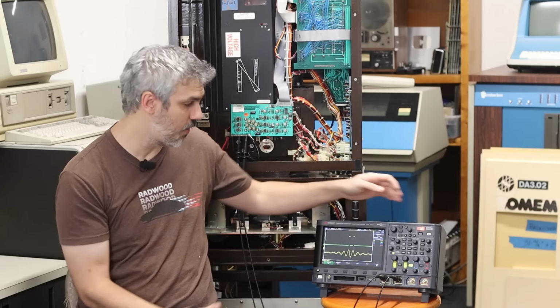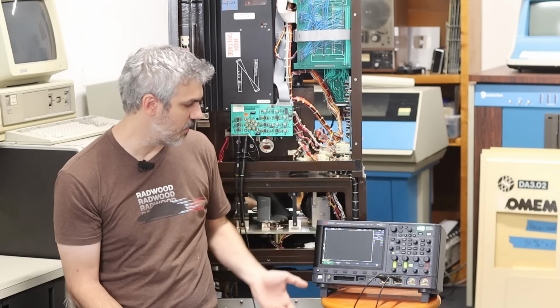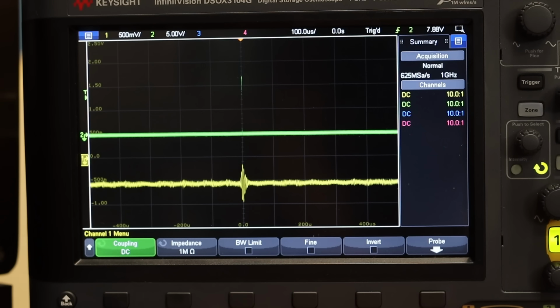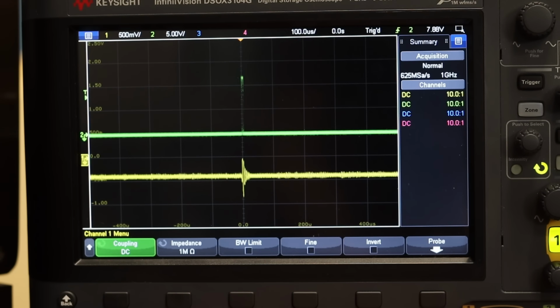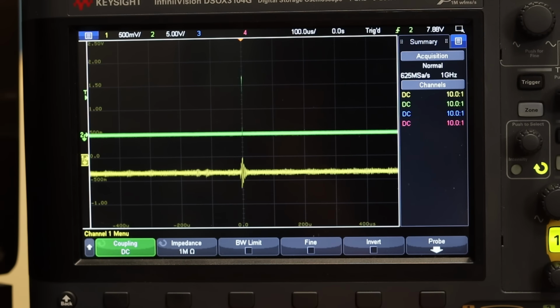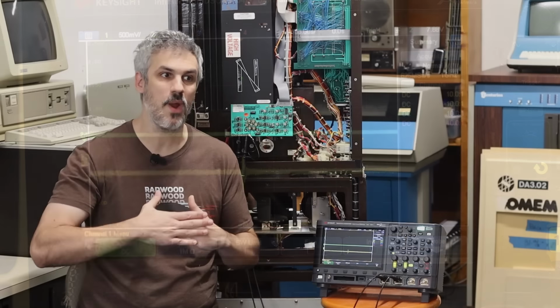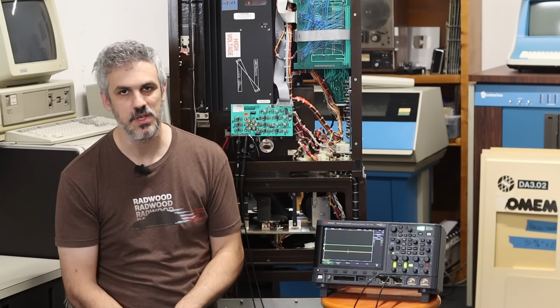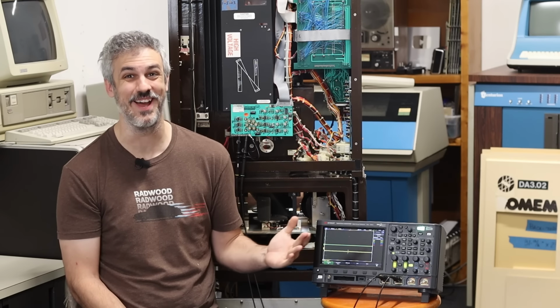While this looks perfect, if I hit run here, and I've just got the scope set in normal mode, you're gonna see that the green trace starts popping off. And the reason is that there is noise showing up on the Z signal, and that noise is loud enough that the op-amp chain is triggering. And the computer thinks that there's multiple ZPDs throughout the entire distance of the mirror, and everything's getting very confused. So where is this noise coming from? And that's the million-dollar question.